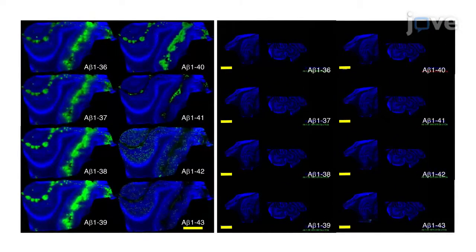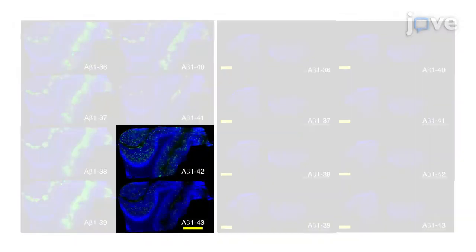The cerebral amyloid angiopathy or CAA phenotypes of patient number 3 were most prominent in this study. MALDI IMS of this patient's brain tissue clearly visualized that amyloid beta 1 to 42 and amyloid beta 1 to 43 were preferentially deposited as senile plaques in the cerebral parenchyma.